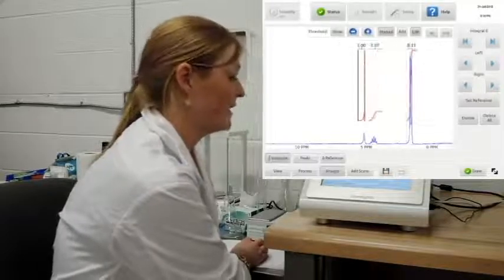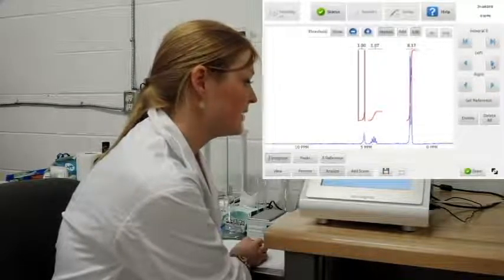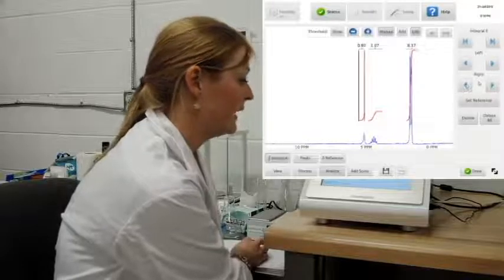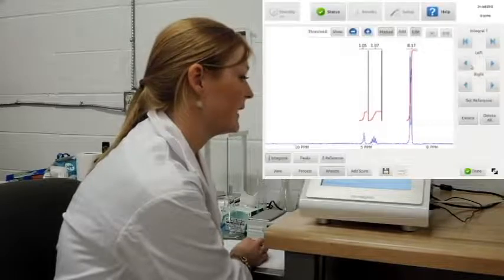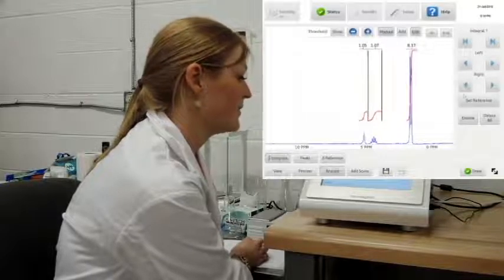Okay. Again, it's very easy to fix the bounds that you've set up. If you don't like the way that you set the boundaries, I can extend them or diminish them as I need on both bounds.